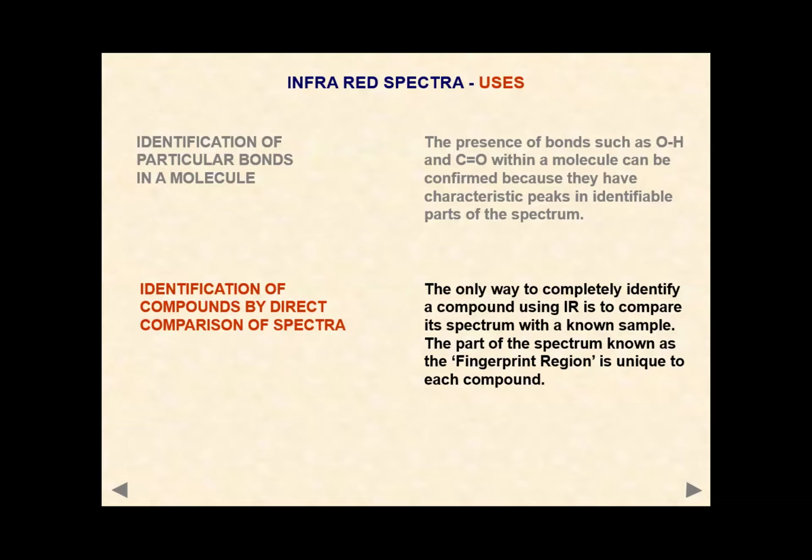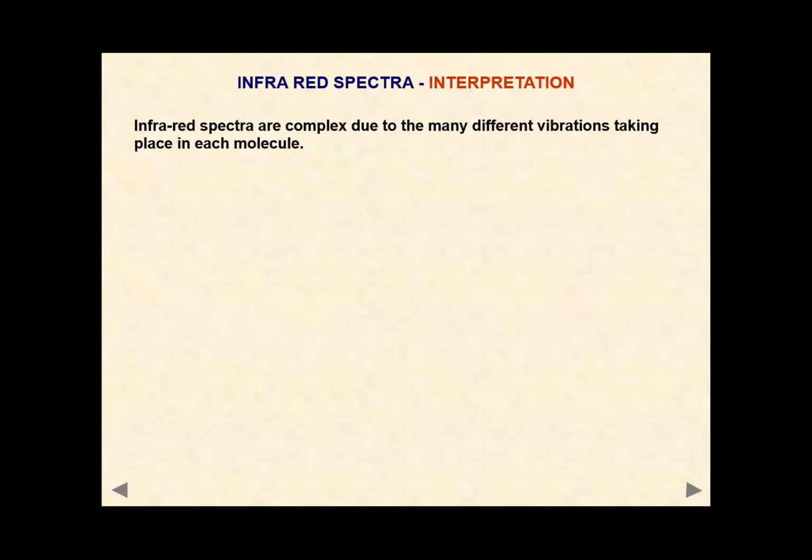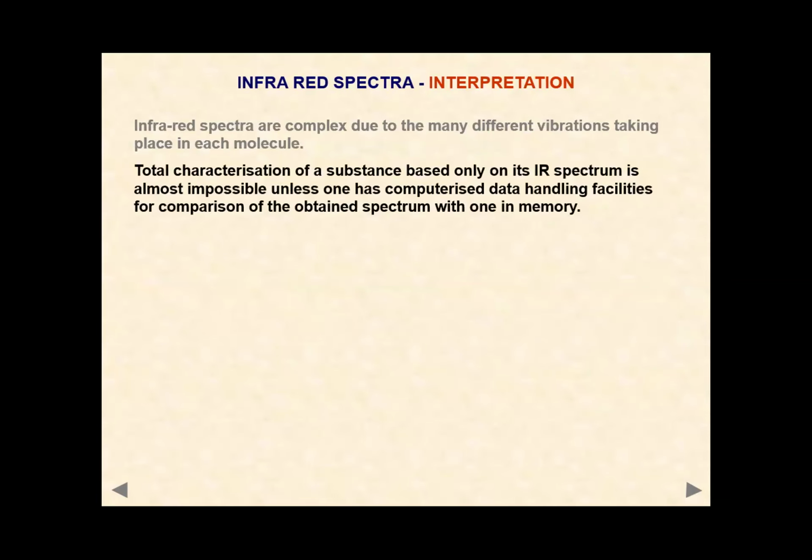All right. Infrared spectra are complex due to many different vibrations taking place in each molecule. Total characterization of a substance based only on its IR spectrum is almost impossible unless one has computerized data handling facilities for comparison of the obtained spectrum with one in memory. Actually, what we do is we connect the data.